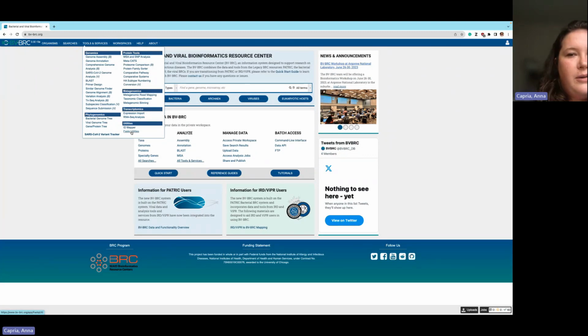Feel free to follow along with me on your device. For the first step, I will be using a file on my local machine, so that won't be follow along, but for the SARS-CoV-2 genome analysis, we'll be using an SRA number, so you can follow along with that.